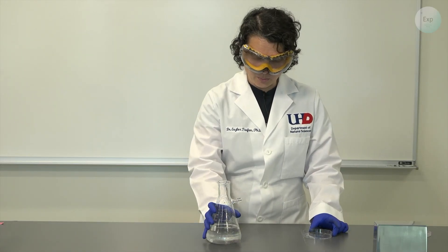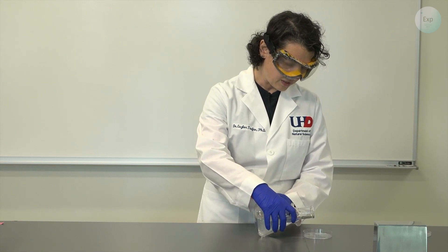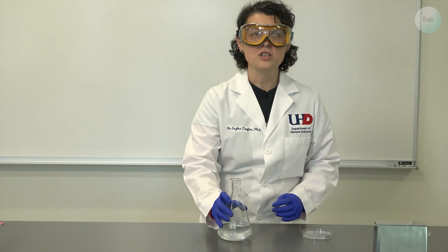I will take my petri dish, open it up, and transfer a small amount of my saturated solution onto it, and that should be just the right amount.